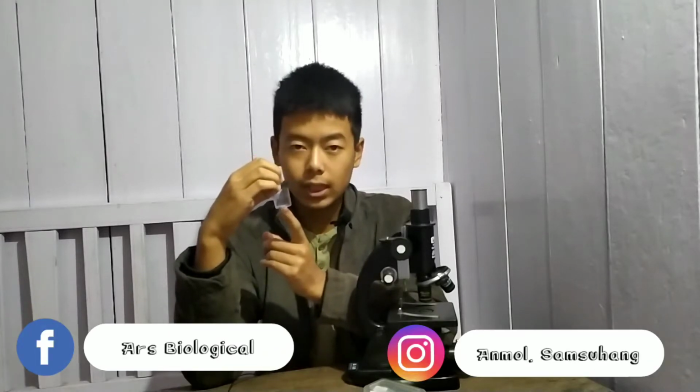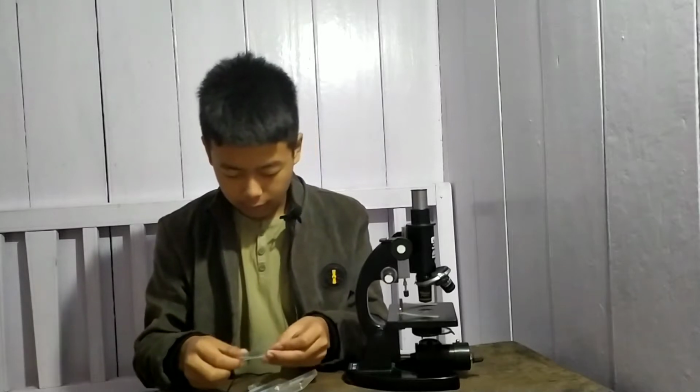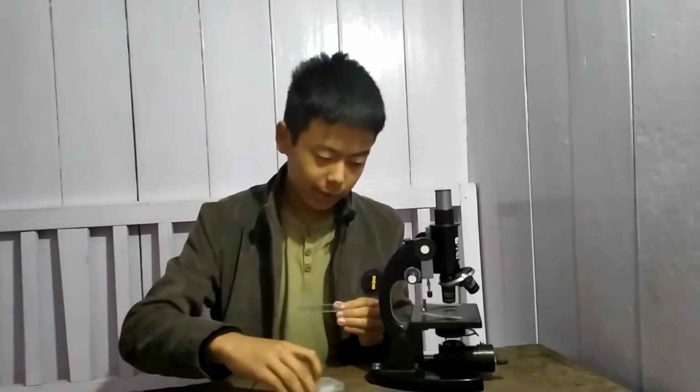Well, I have caught two fleas from a dog from my native area, and you all must be wondering if it's alive or dead. I say that these organisms are alive right now also. So I'm going to take some microscope slides. I'm taking two slides this time because I am placing one slide on top of another just like this and placing the specimen over here, compressing the specimen with two slides. This will not kill those fleas, but yes, they will kind of be in trouble.